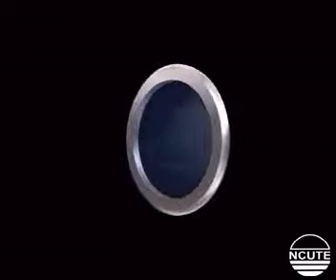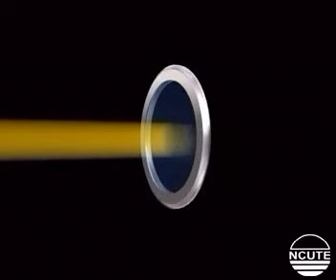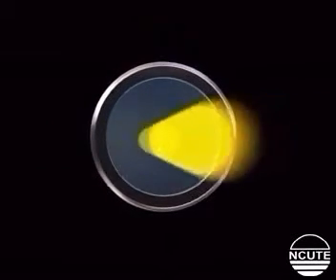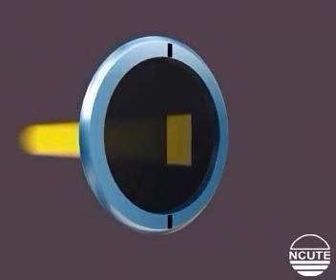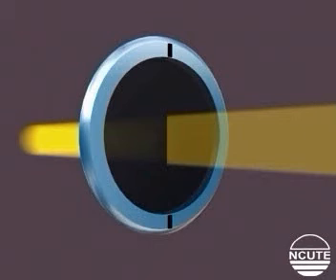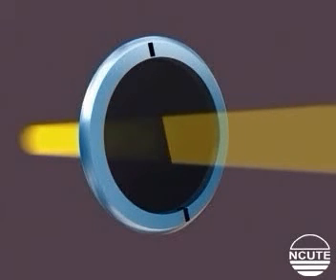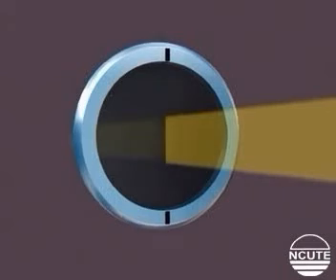If plain transparent glass is brought into its path, see that the light is transmitted completely without any visible change. If instead of plain glass we now introduce a polarizer, note that the emerging light is vibrating in a plane parallel to the direction of orientation of the polarizer. This is called polarized light, and as you can see for yourself, its intensity is obviously less than unpolarized light.